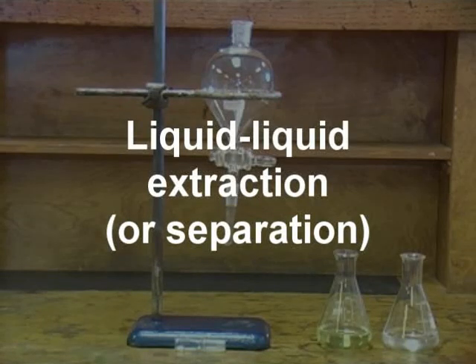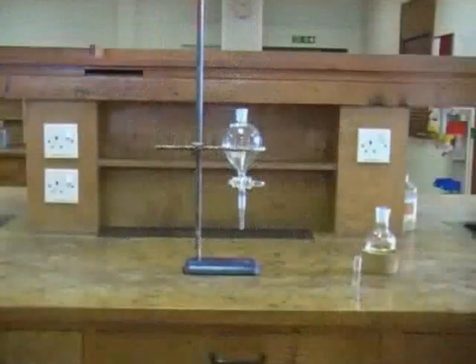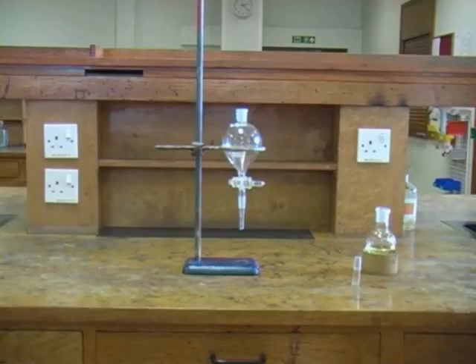The technique of liquid-liquid extraction is a form of solvent extraction which is often referred to simply as a separation. We do this using a separating funnel as shown on the screen. The technique can be used in a range of contexts and it's important that you understand why you're carrying out a separation in the experiment that you're doing.